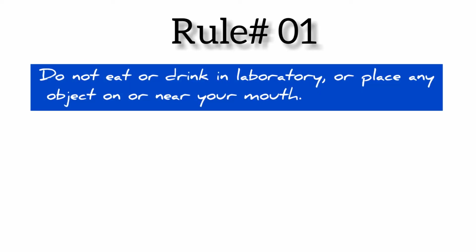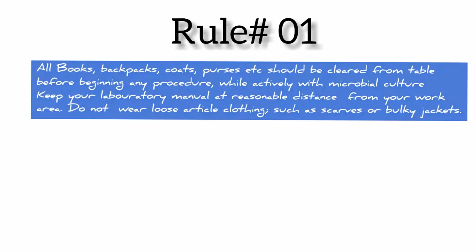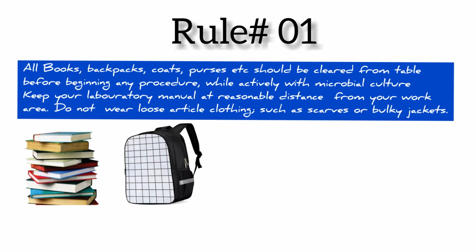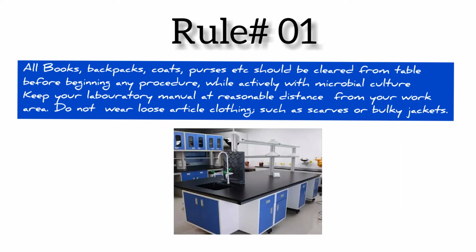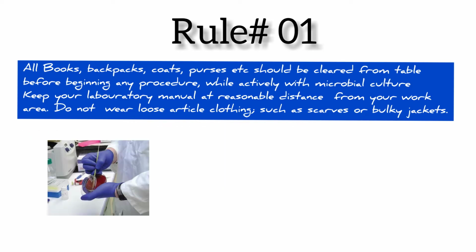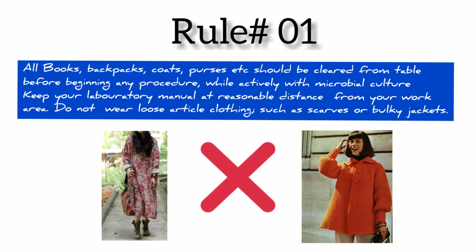Now the first rule is do not eat or drink in the laboratory or place any object on or near your mouth. All books, backpacks, coats, purses, etc. should be cleared from your table before beginning any procedure. While actively working with microbial culture, keep your laboratory manual or instructions at a reasonable distance from your work area. Do not wear loose articles of clothing such as scarves or bulky jackets.